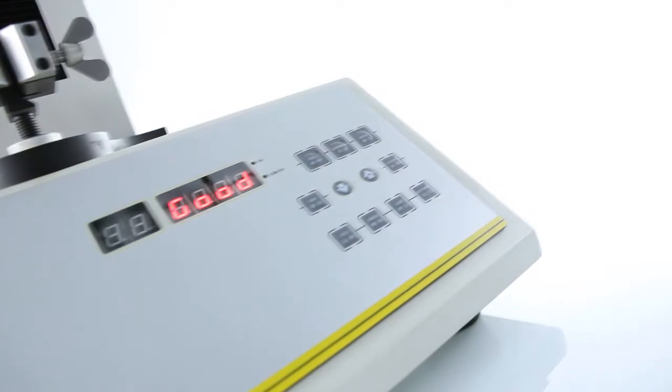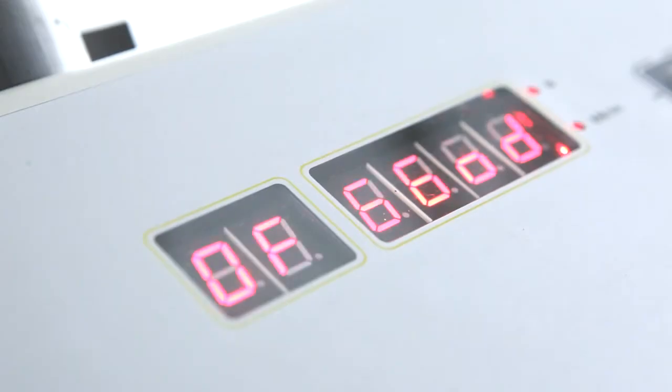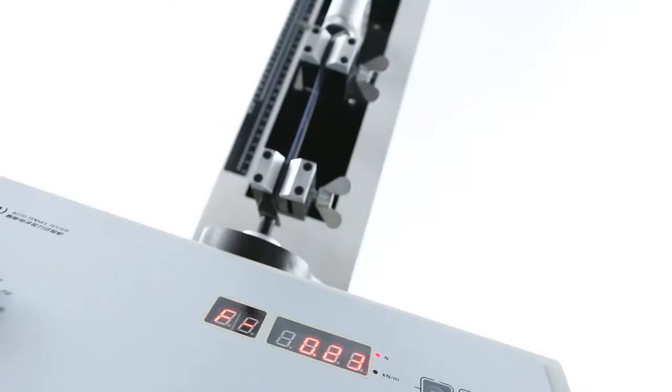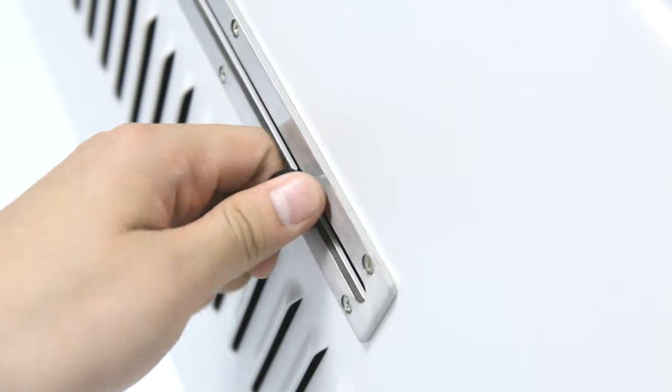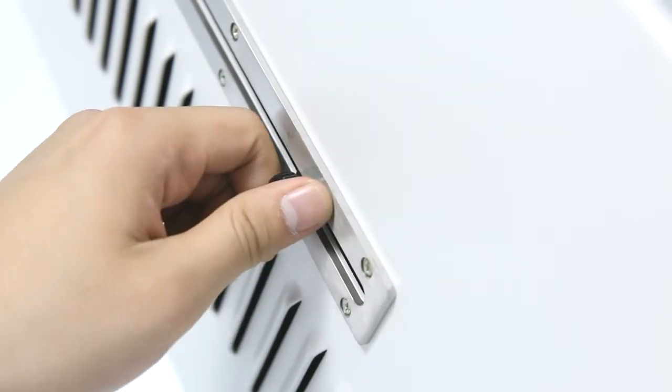This instrument also adopts functions of malfunction alerting, overload protection, and over travel protection.